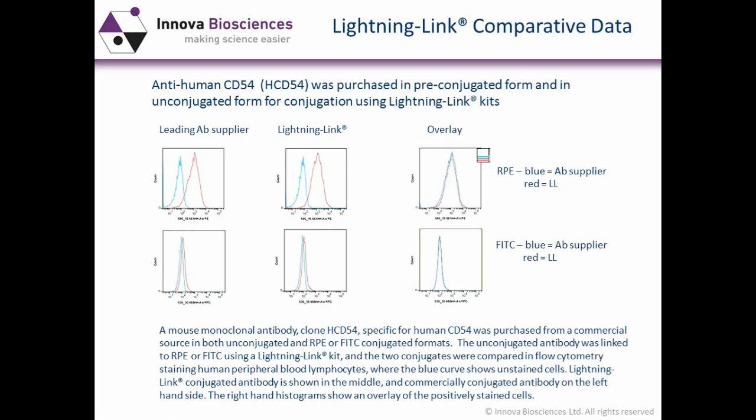So those results demonstrate how the Lightning-Link reactions give you exactly the same performance as you will obtain with commercially obtained antibodies. So I'm going to stop there. I hope that some of this has been useful. I'm going to pass back to Claudina, and I think we see some questions coming in, and we'll try to answer some of those in just a moment.